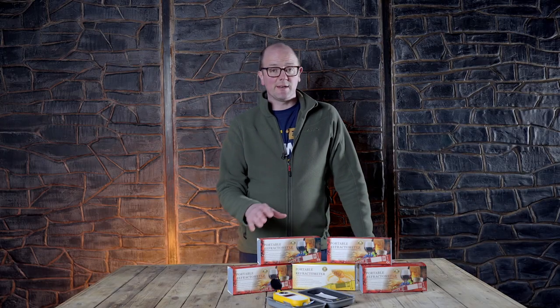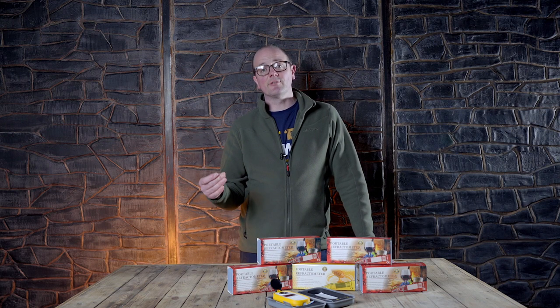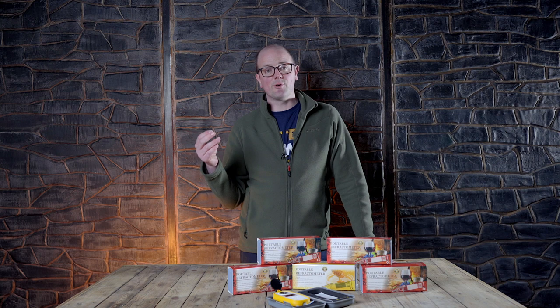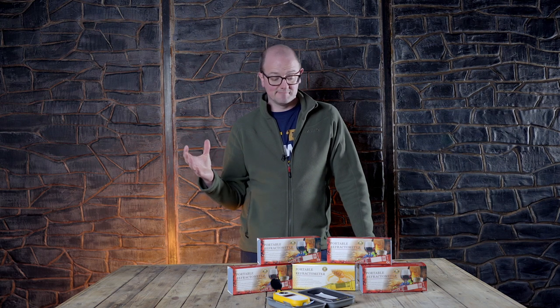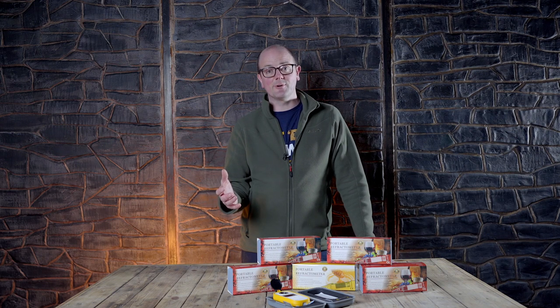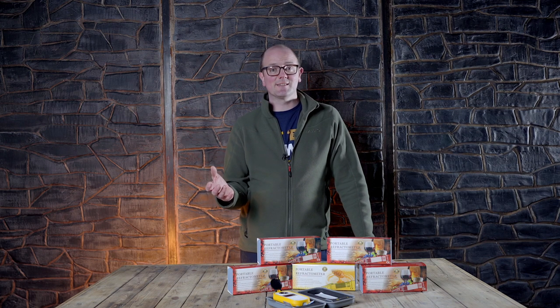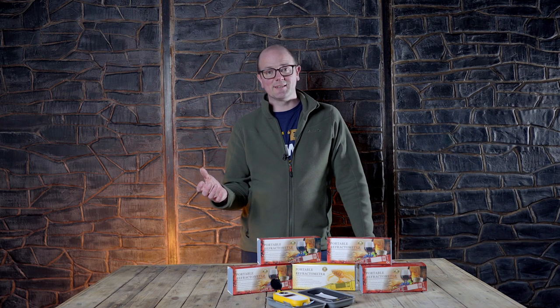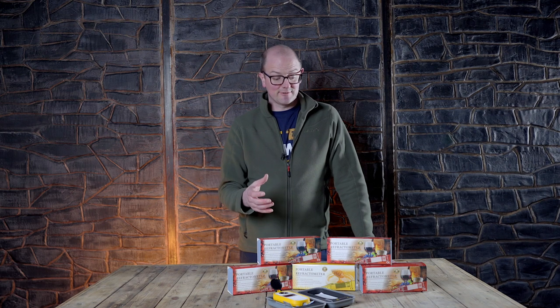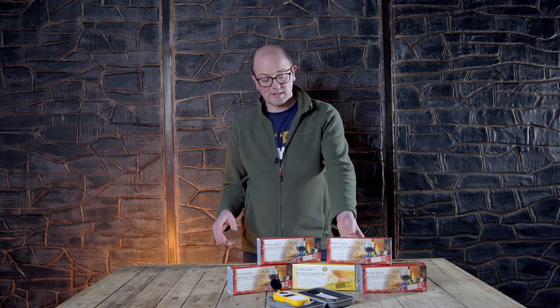The refractometers we stock at Get A Brewed cover everything from beer, wine, honey for the mead producers, and alcohol for distillers, through to pretty much all types of brewing — whether that be for wine brewing where you want to check the Brix and the content of the grape must, whether it's honey and you're wanting to check the sugar content for mead production, or whether it's just beer and you're wanting to check the sugar content.